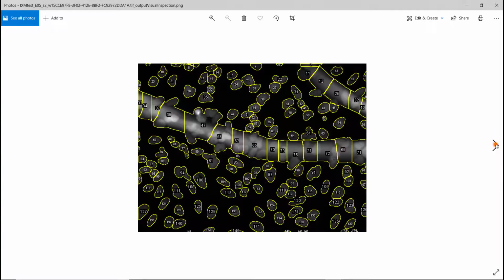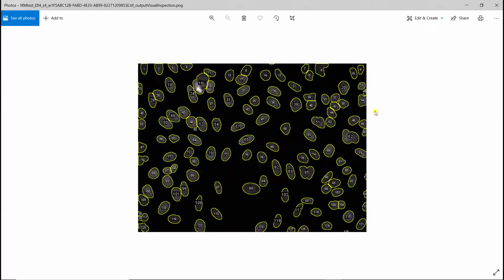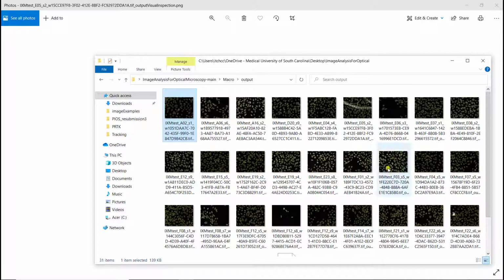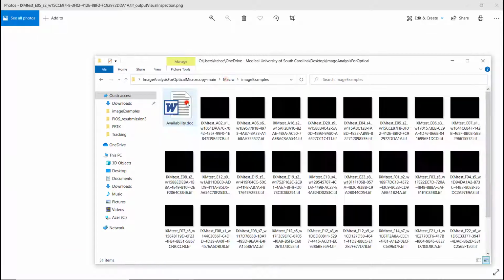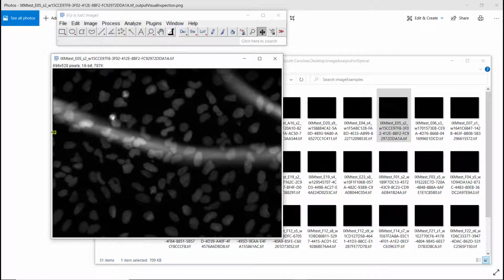And you can go through your results, and here, very importantly, you see that you made a huge mistake, and it's because there was some problem with the acquisition. We can go back to the image. So if I go in my input image, number 6, if I open it with Fiji, I can directly see that there was a problem during the acquisition, and that's why the segmentation was messed up.